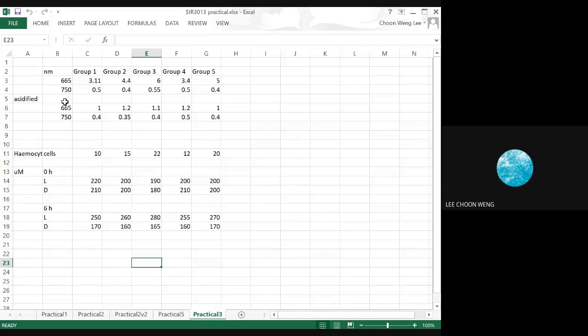So this uses the spectrophotometric method, which measures light. There's another method which uses spectrofluorometry. That one measures fluorescence, because I've already mentioned earlier that primary producers autofluoresce, so their chlorophyll pigments can fluoresce.